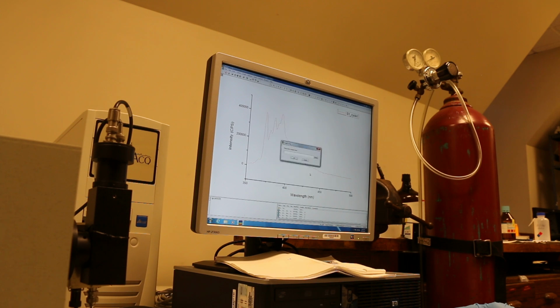Most molecules don't have the sharp spikes that pyrene has. It's harder to see the vibronic structure. And there we go, that's cresyl violet. So taking fluorescence spectra isn't too laborious or time consuming. The main issue is getting rid of contaminants out of the solution and interpreting them. Interpretation of fluorescence spectra can be a bit tricky.